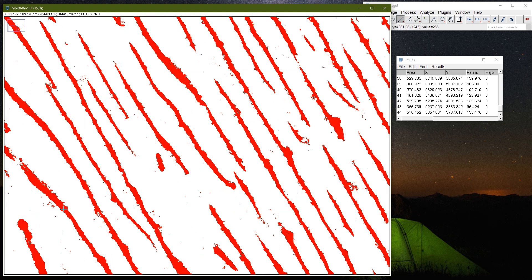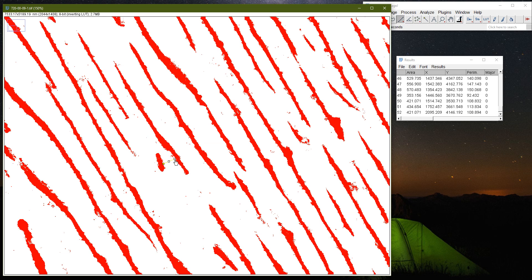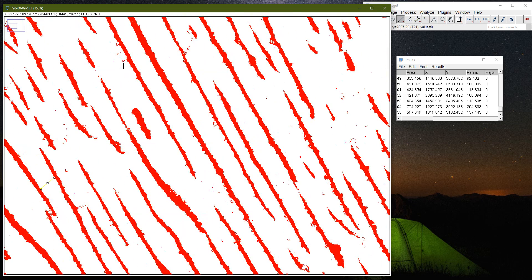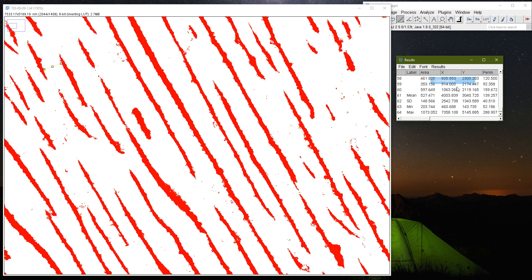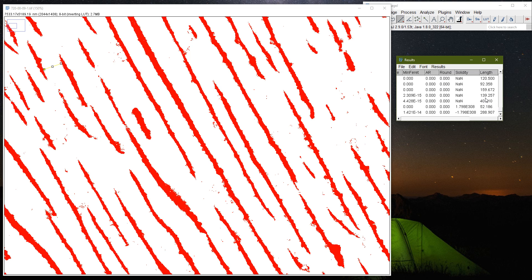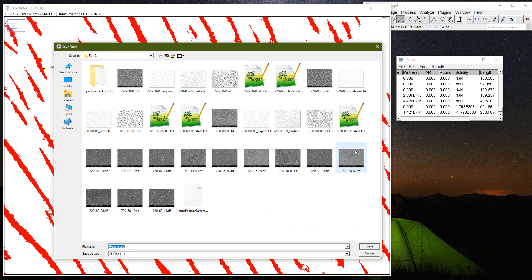You can also use this manual measurement technique in Fiji ImageJ for other features if you are interested. We have now collected around 50 points and I will collect a few more to be more statistically accurate. Once done, I click on Results, then click Summarize, and it summarizes all the results. I can see that the mean inter-lamella spacing for this material is 139.2 nanometers. Then I click File > Save As to save the file as a text file.